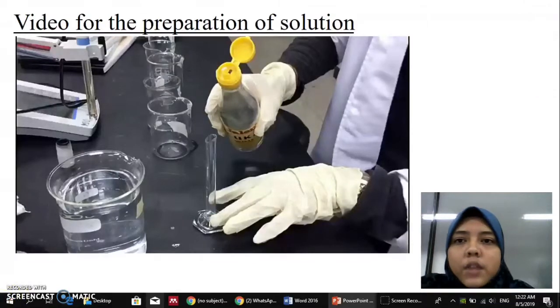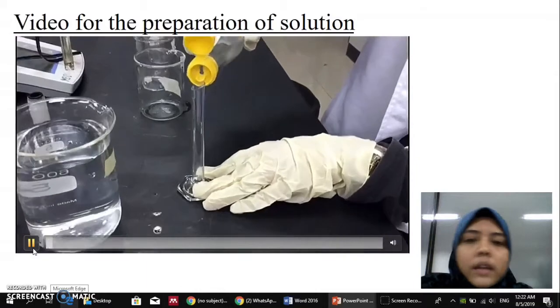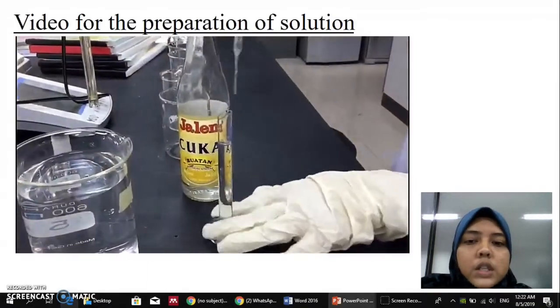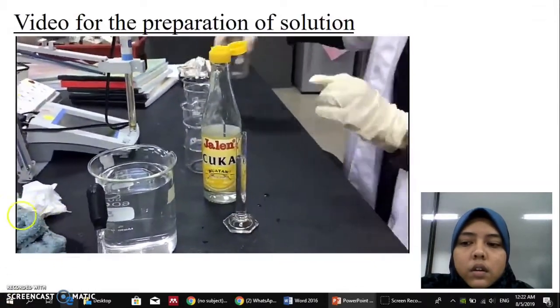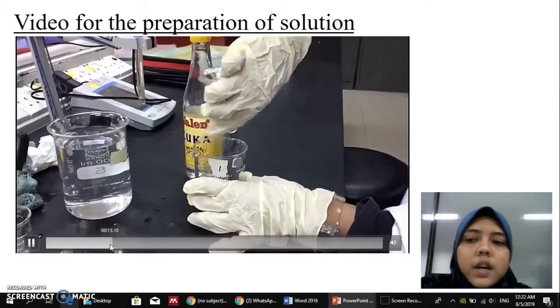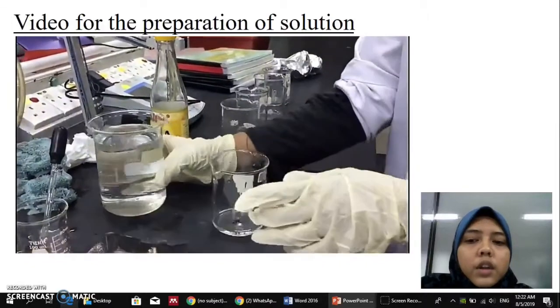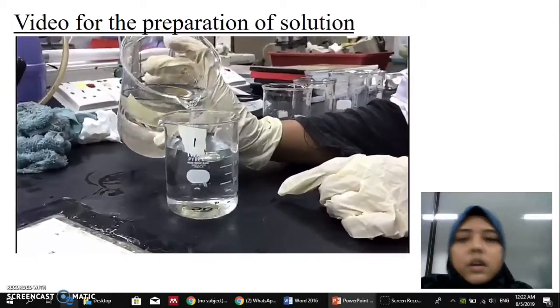So this is the video of the preparation of the solution, where 10 ml of vinegar was measured using a measuring cylinder, then put in the first beaker, and 190 ml of dechlorinated water was filled in the beaker.